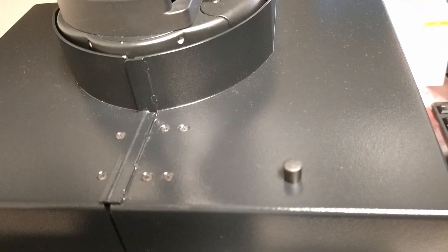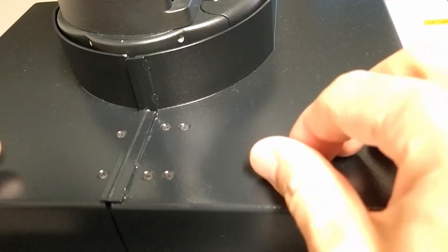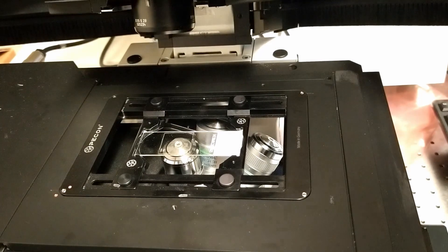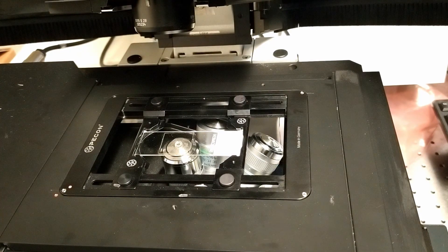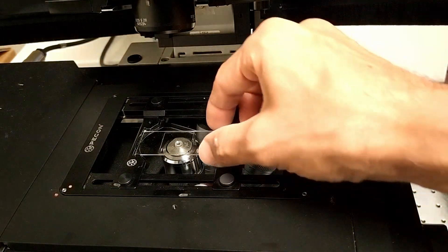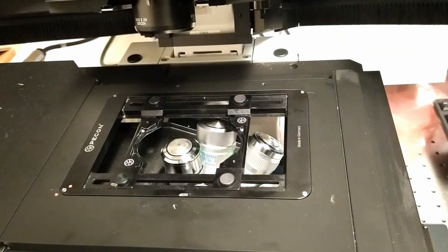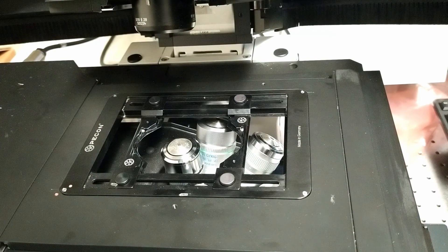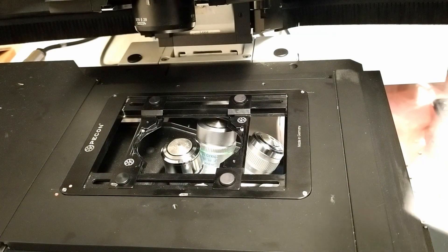Now I'm going to show you how to clean an oil objective — we're going to demonstrate it on the wide-field. Open the safety box and tilt the condenser arm back. Before taking the sample out, lower the objective, and then carefully take the sample out. For cleaning, we always use lens cleaning tissue — take one tissue out of the box.